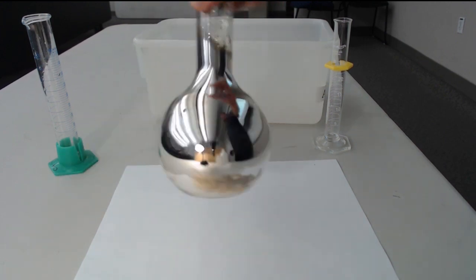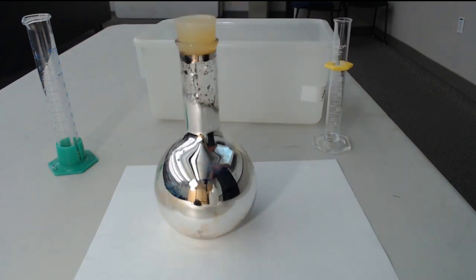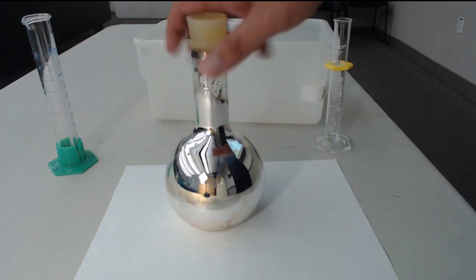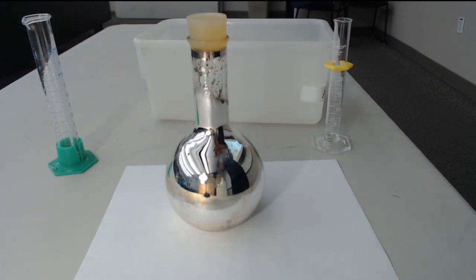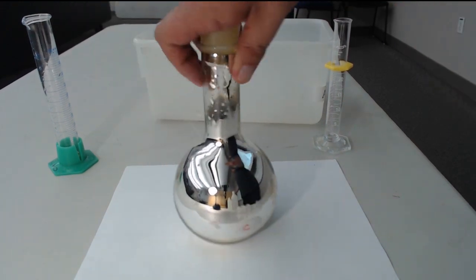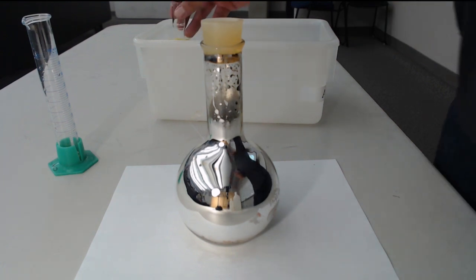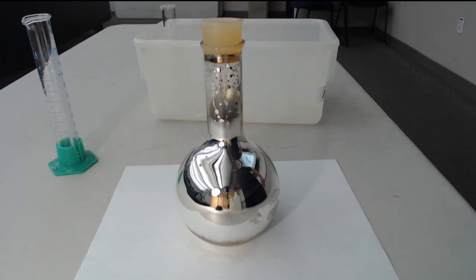People used to also make mirrors this way. Basically, you take a glass sheet and you cover it with formaldehyde. Formaldehyde is similar in structure to a couple of different sugars. And then you can treat it with a Tollens reagent and then the silver will just plate out on the glass. And then you cover it with another sheet of glass to kind of protect it. And then you put it in a frame. Most mirrors nowadays though, are made out of thin sheets of aluminum. It's actually a lot cheaper than an actual silver mirror. But if you actually have one of those old fashioned mirrors, one that has the big like wood frames on them, those are typically actually silver on the inside. And don't try to go break your grandma's mirror now to get the silver out of it because silver is actually dropped dramatically in price.